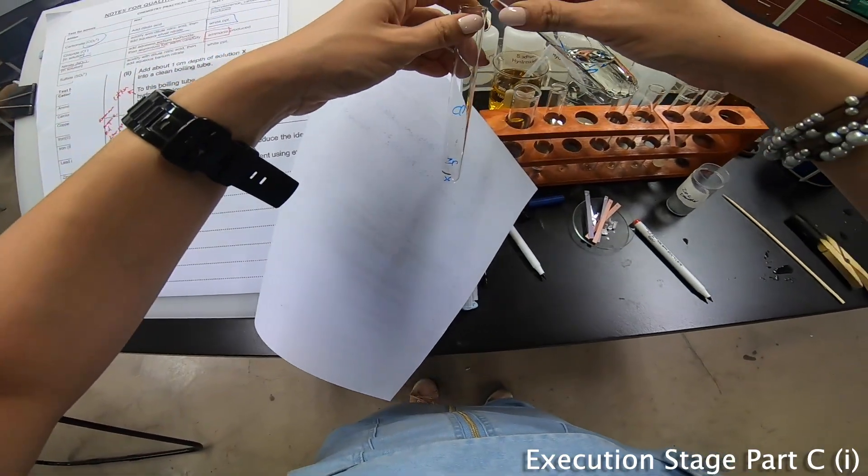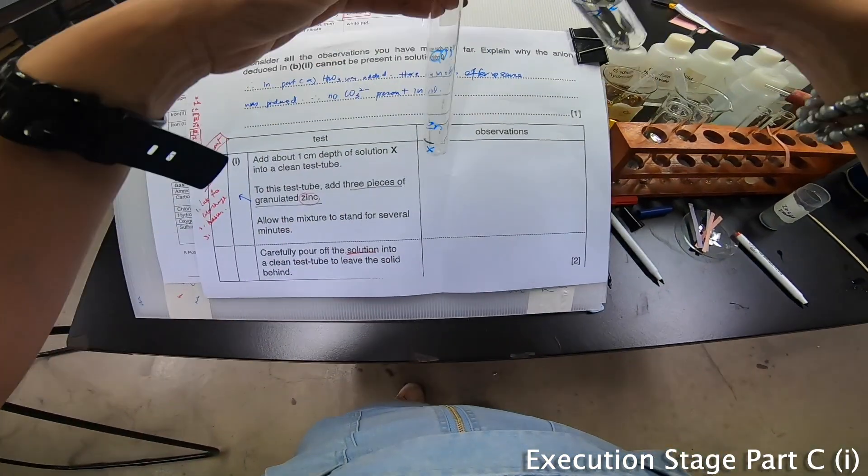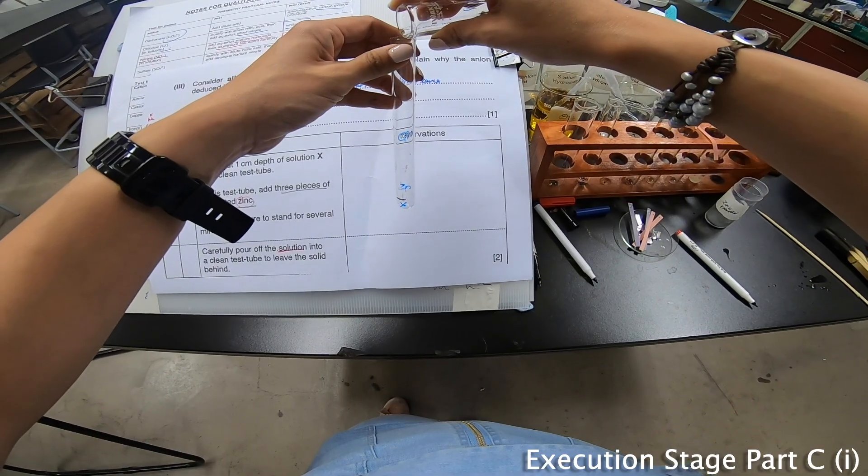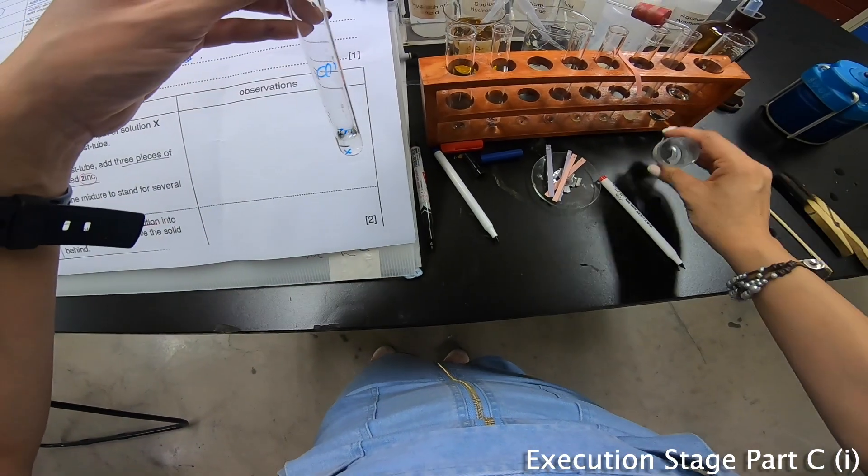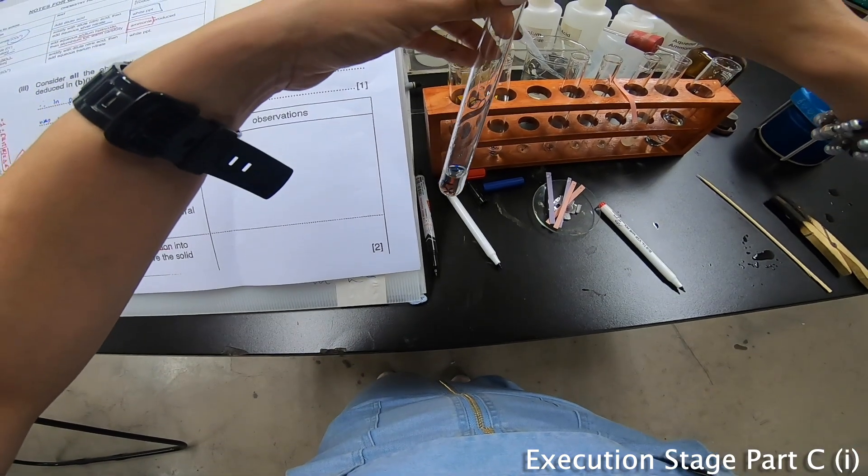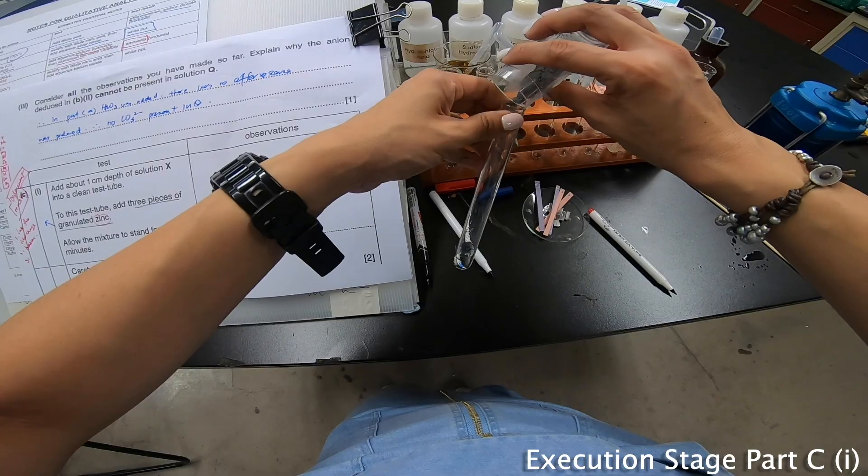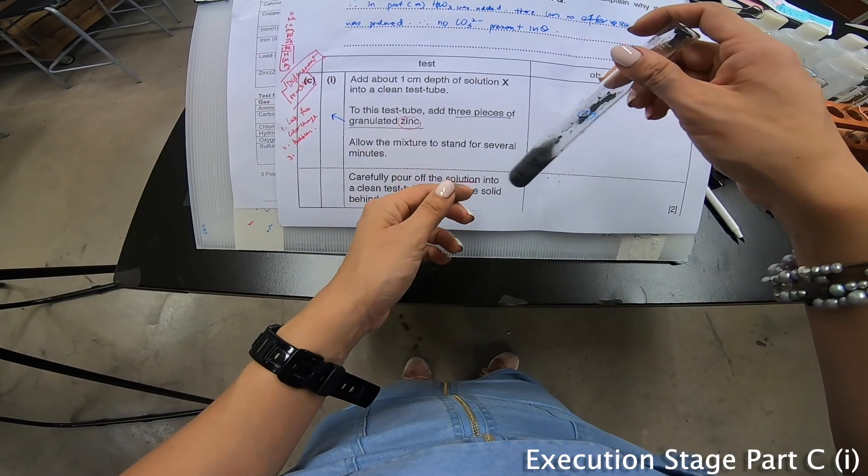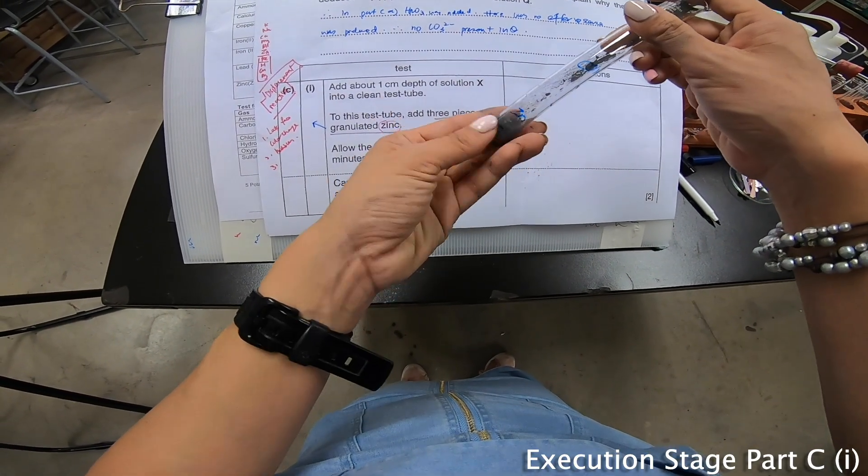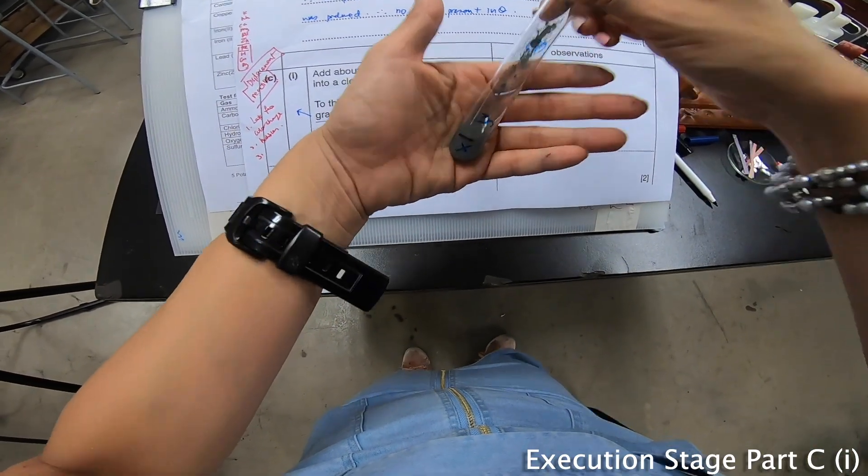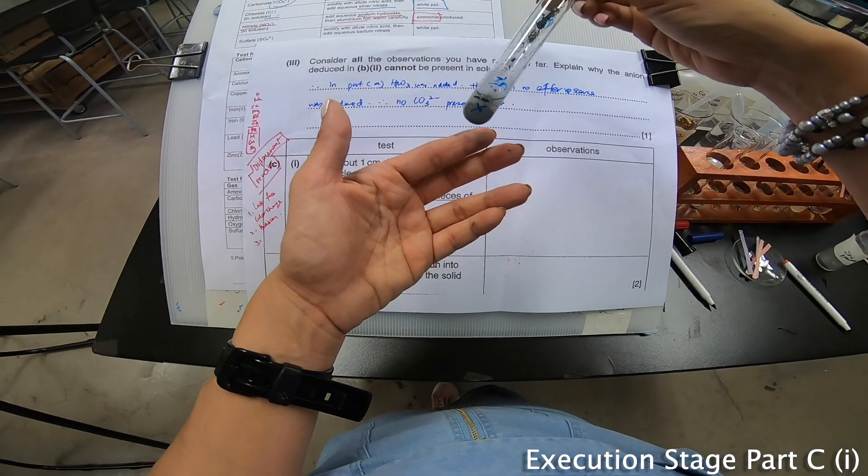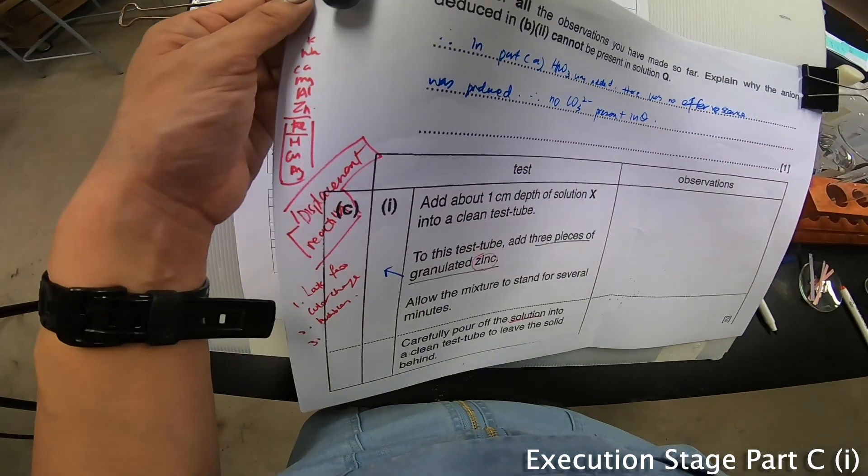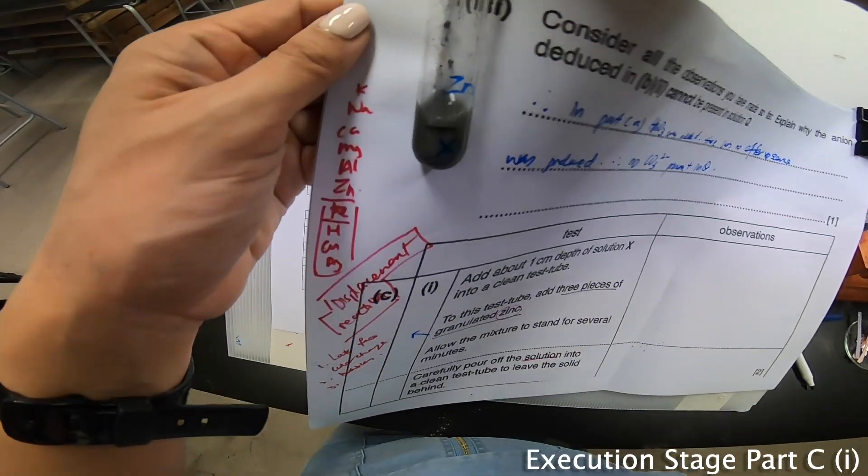This is my X, so I'm going to pour out X. Pour a little bit of the zinc inside - zinc powder. Allow the mixture to stand for several minutes. At the moment, I feel that the texture itself is hot, and not only that, I can actually see bubbles forming. I'm going to use the white backing. I hope you can see - I see slight bubbles forming.